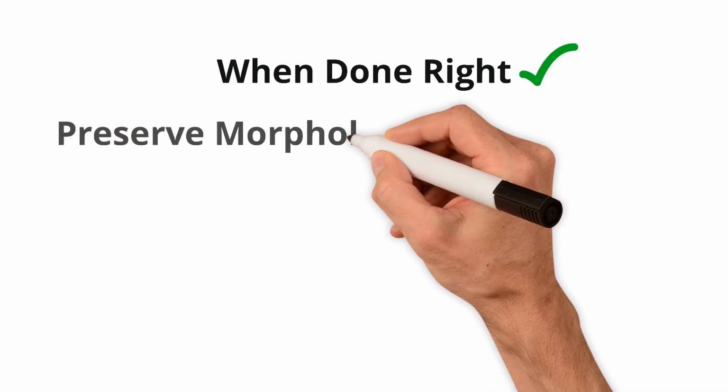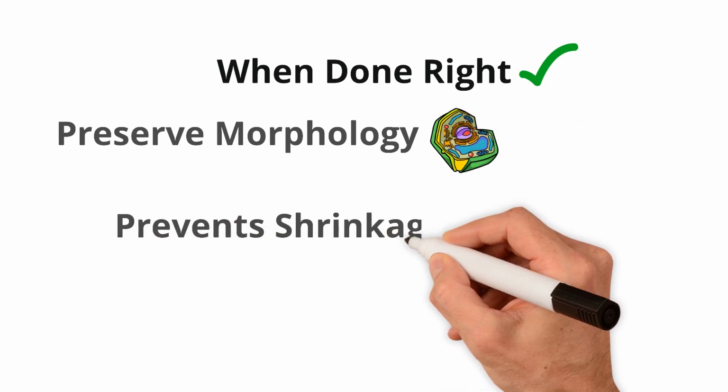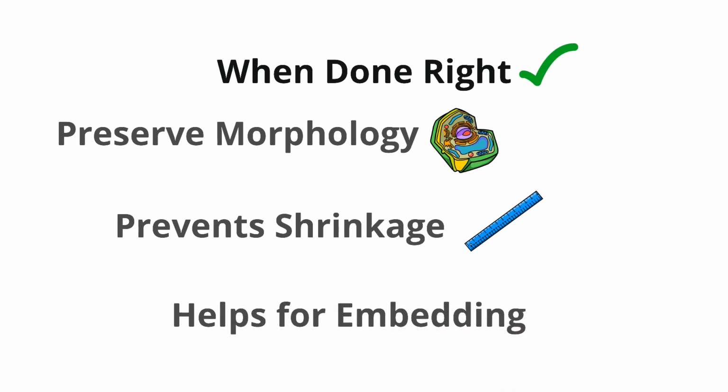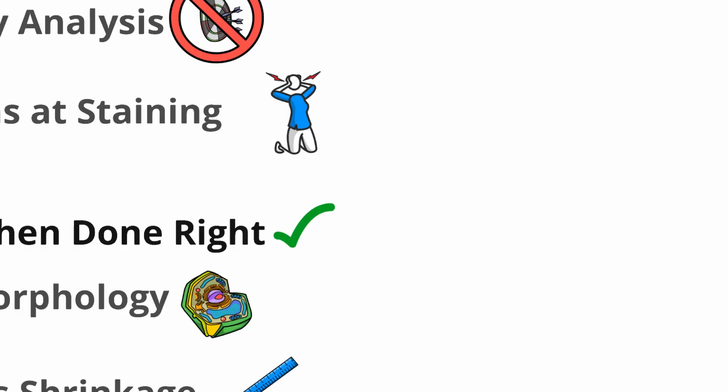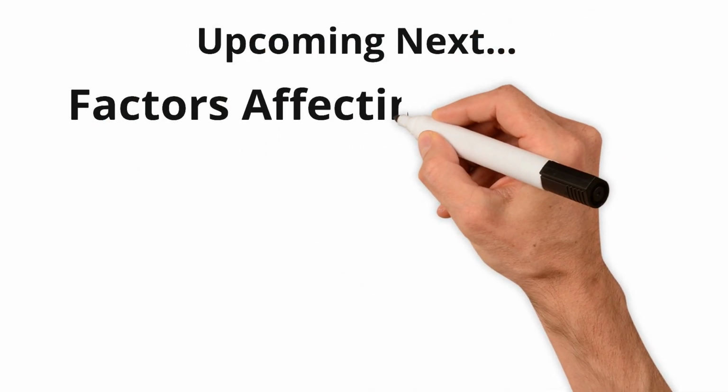But when your fixation is done right, it preserves morphology, prevents shrinkage, and helps prepare tissues for embedding. In our next episode, we're going to talk about the factors affecting fixation and its quality.